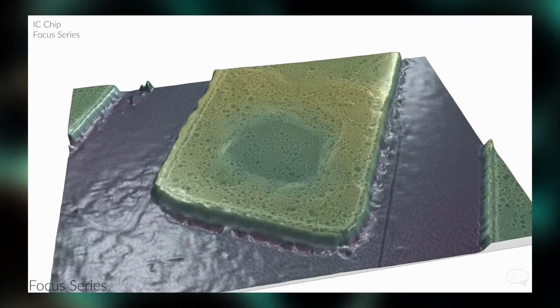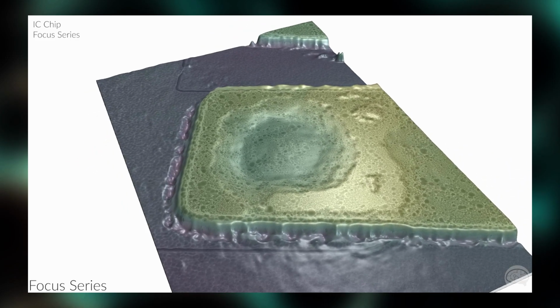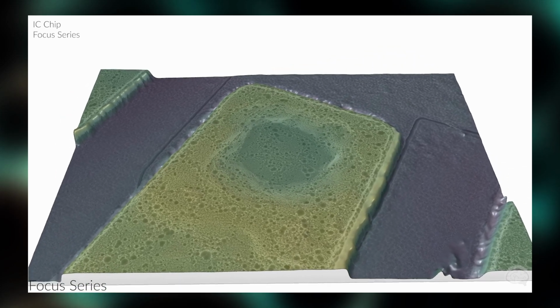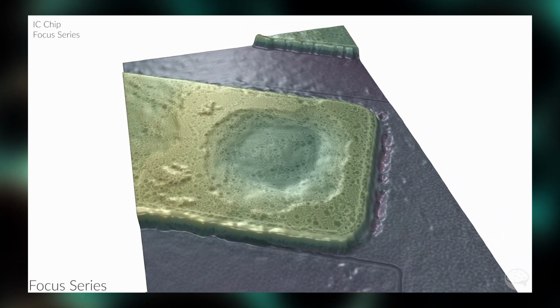Fantastic. So what is potentially good about this method? First, your Z numbers would be very accurate, and it would handle high aspect ratios very well, just like the stereo pairs method. However, it probably wouldn't freak out over flat or featureless areas quite like the stereo pairs do. In my experience, you can end up with outlier pixels, like you often get with stereo pairs, but that can be mitigated a bit by running the microscope with the shortest working distance you can get and taking a lot of images. The downsides are going to be that the data collection in the SEM is likely going to be a bit time-consuming, and there will be small gaps in the Z data.